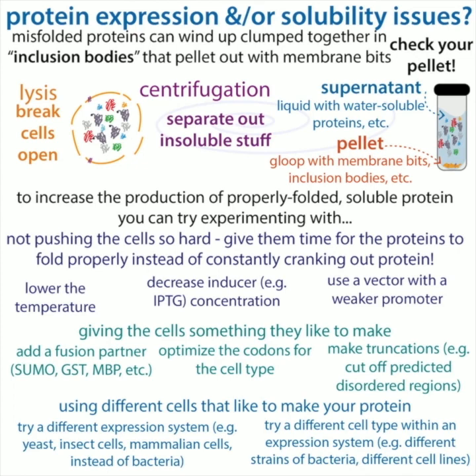If you had protein and then you try to purify it and you don't have anything, the protein should still be somewhere, so you want to figure out where it was. If there was a problem with the resin, the little beads, or maybe you accidentally added the competitor when you thought you were doing a wash and you were really doing an elution, which I've done before and it's very, very painful, then that would show up there.